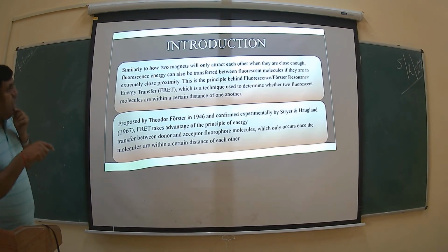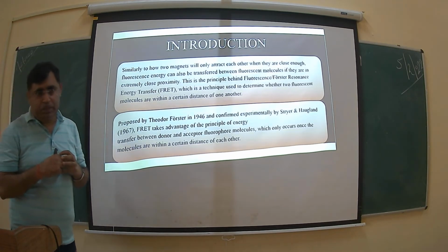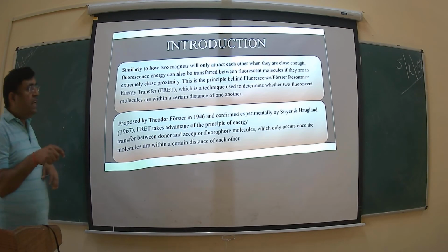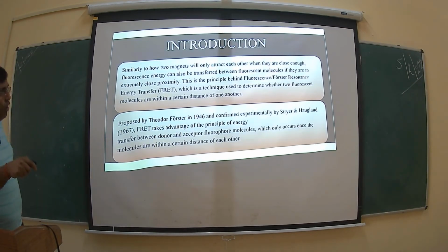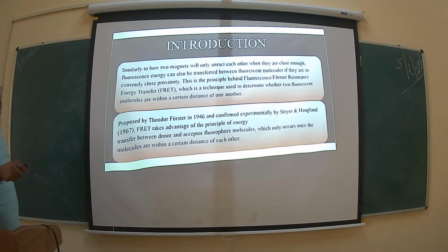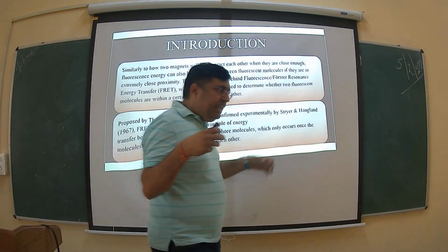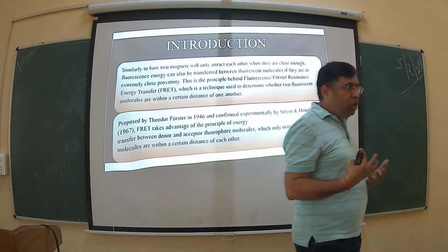Fluorescent energy can also be transferred between fluorescent molecules if they are in extremely close proximity. This principle is behind fluorescence or Foster resonance energy transfer, a technique used to determine whether two fluorescent molecules are within a certain distance of one another. So definitely they are tagged with some protein molecule.